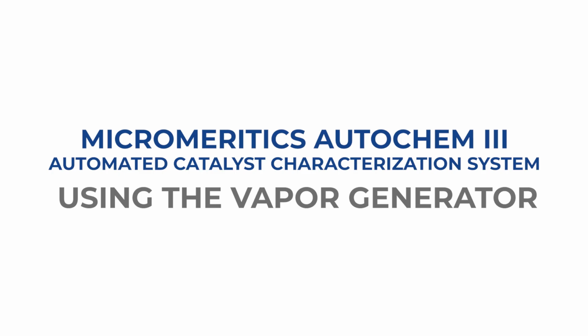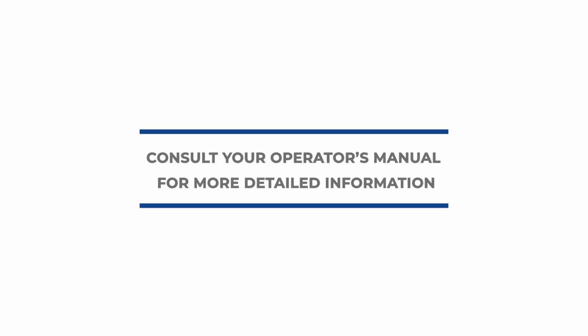This video will show you how to use the vapor generator on the AutoChem 3. Remember to always consult your operator's manual for more detailed information.